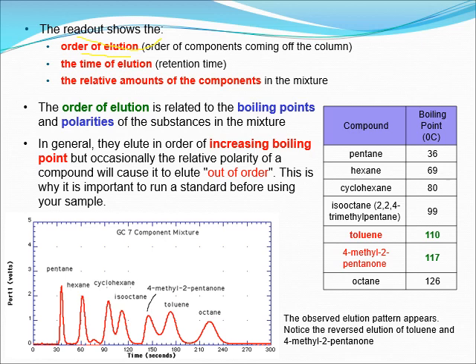The components that come out on the chromatogram are based on an order, and the order is according to the boiling point of the compounds in your sample. So if your sample has 4 to 5 compounds, the first compound to appear is the compound with low boiling point, and the last one is the compound with high boiling point. They have a retention time, which is the time of elution; the earliest is the low boiling point compound. The order of elution is based on boiling point again, and also the polarity of the compounds in your extract.